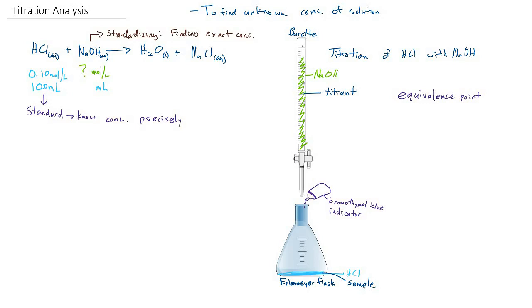And if you check for an acid, bromothymol blue turns yellow. So we can expect our sample to turn yellow at this point, once we've dropped our indicator in. Now we can go ahead and open the stopcock on our burette, and let some sodium hydroxide in. And so our sample that was yellow, we will see turning blue when a base drips into it. Because when bromothymol blue is in a base, it turns blue.